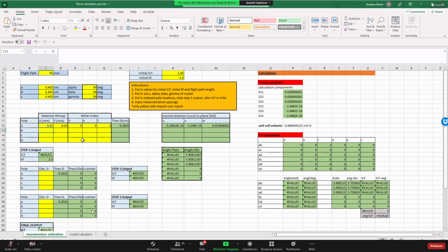The next one was at 3.03, 21.66, and then 024, not 012, so using the higher index there. And then 17.72 and 9.18.